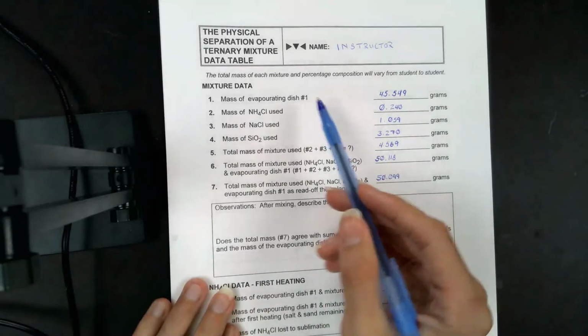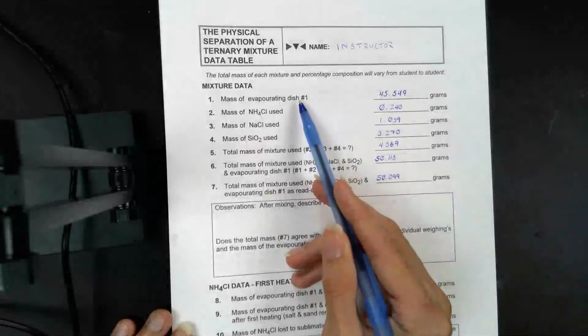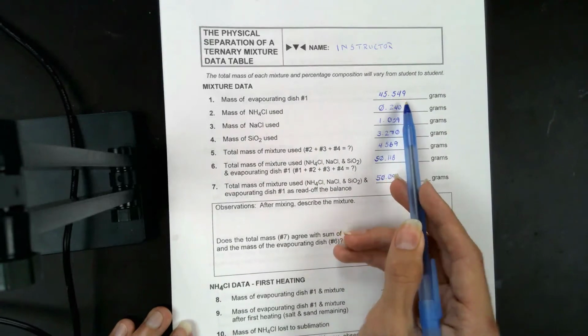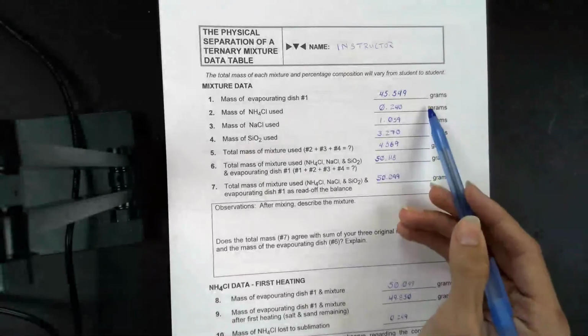So the mixture data, this is the first part of the data sheet. Item number 1, that's just the mass of the evaporating dish. So my first evaporating dish that I started with, I just weighed it empty and recorded that here. Now these next 3 items, 2, 3, and 4, are where I recorded my masses for the 3 components.